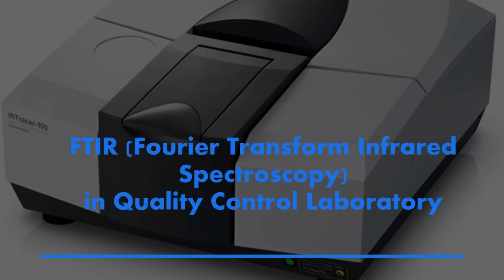Today's video is a complete masterclass on FTIR, that is Fourier transform infrared spectroscopy, which is one of the most widely used instruments in pharmaceutical quality control laboratories. So in this session we will go beyond theory and look at practical, real-world FTIR use in a pharmaceutical QC lab.